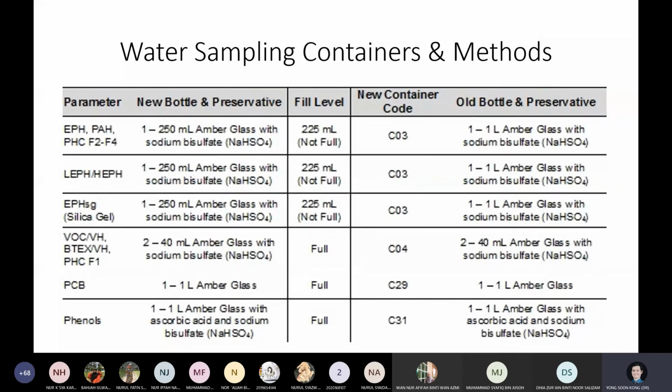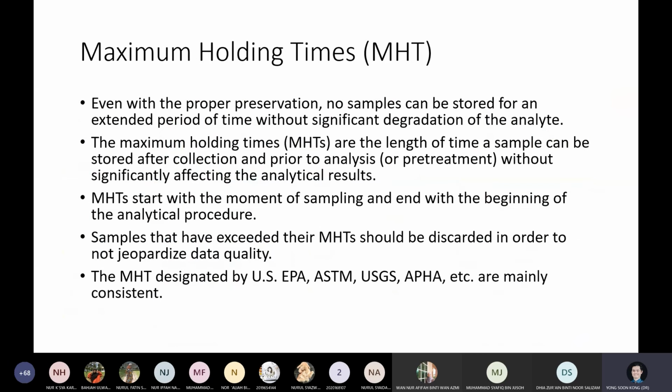I don't want to explain these things, because I have already explained the general part: the chemical name and also the specific name of the material of containers that you might use with the contaminants of interest, the analytes that you want to determine. Use your own time. These are examples. I know you can read. I don't need to read it for you.